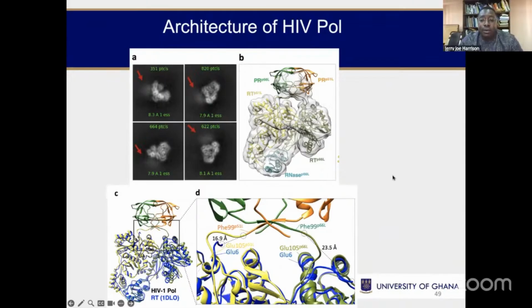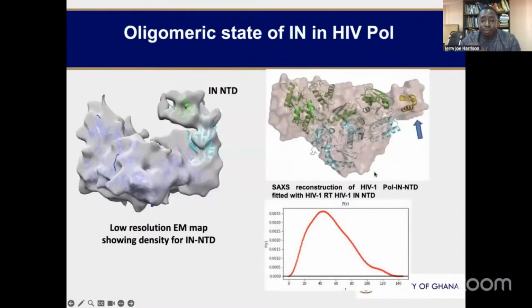Unfortunately, we couldn't recover the density for the integrase, because we reckon that it's very flexible, just like the protease. We couldn't recover the density for the integrase, except that in the 3D classification that we did, you could see the NTD from one of the subunits.